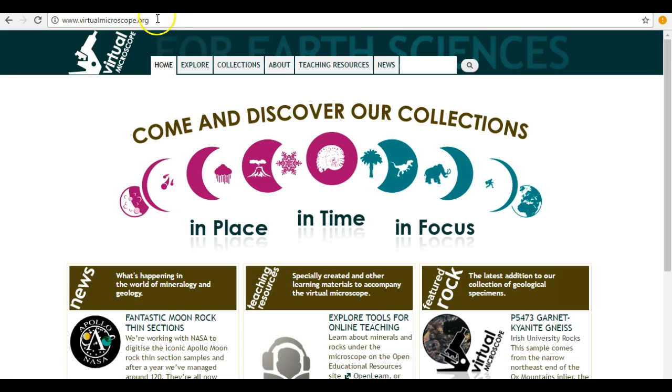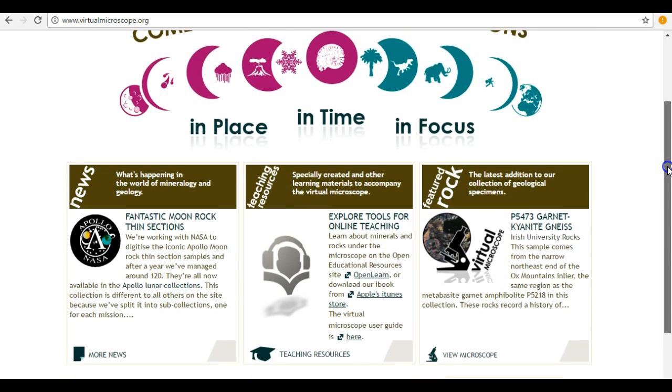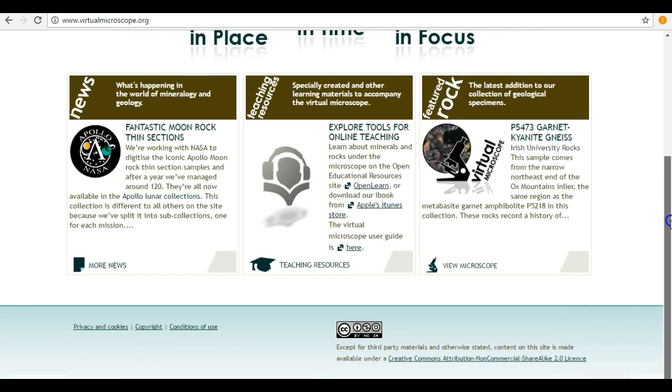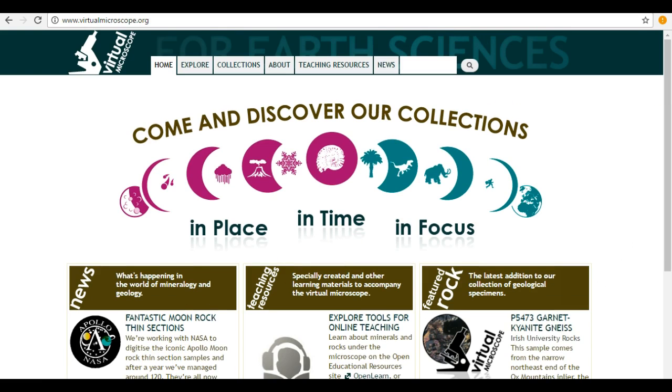Welcome to the introduction video of the Open University Virtual Microscope. This GLab video has been created to enhance the utilization of the virtual microscope for the purposes of teaching and learning. In this video, we will learn about the Open University Virtual Microscope, how to navigate the Virtual Microscope webpage, and how to explore the Virtual Microscope collection.